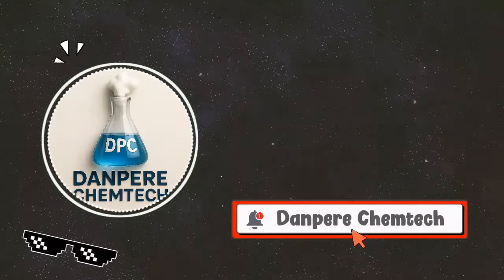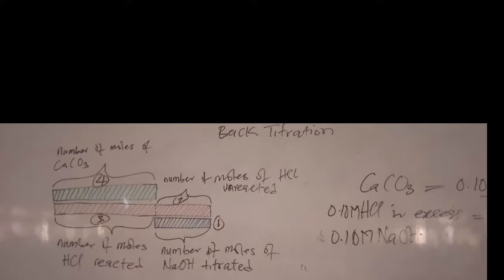Back titration requires two standard reagents and one unknown. One of the standard reagents is added in excess to the unknown, and the mixture is titrated against the second standard reagent. Procedure for calculating the unknown.